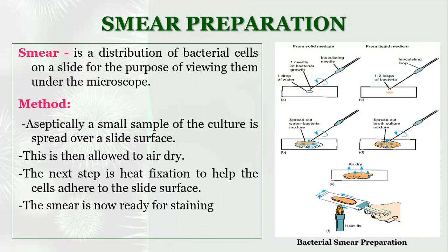Smear is nothing but spreading the organism on a microscopic slide with the help of an inoculation loop or inoculation needle. This spreading causes distribution of the organism on the microscopic slide, so that you can visualize individual organisms on the slide under the microscope. From any solid medium or liquid medium, the smear can be prepared.